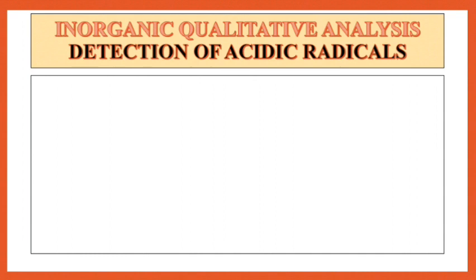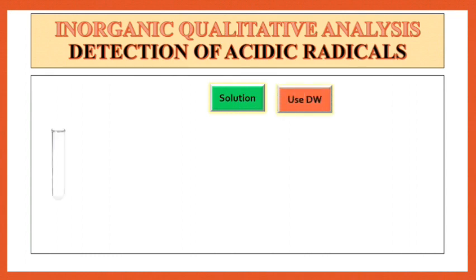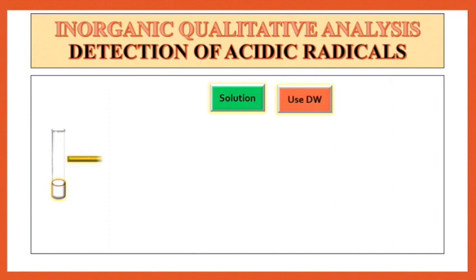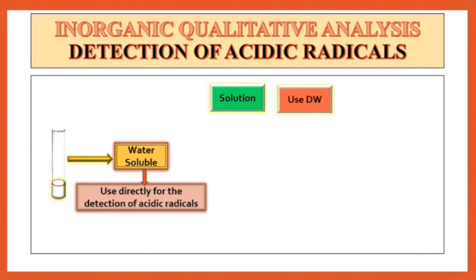Let us prepare the solution for the detection of acidic radicals. For the preparation of solution, always use distilled water. Take a clean and dry test tube, take a small portion of mixture, and to that add distilled water. After addition of distilled water, shake this mixture well. If the mixture is water soluble, then use this solution directly for the detection of acidic radicals.